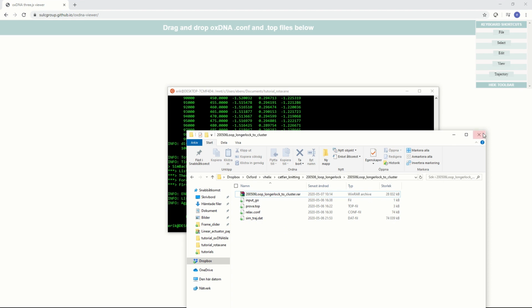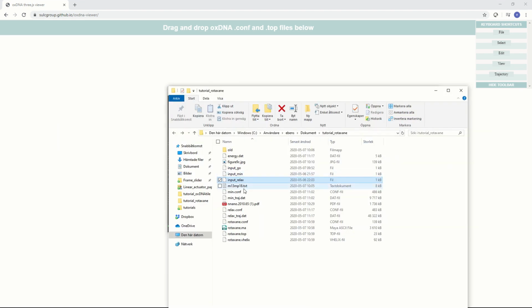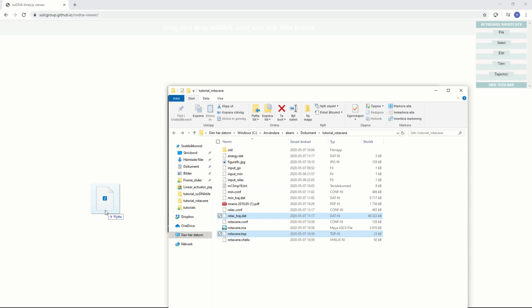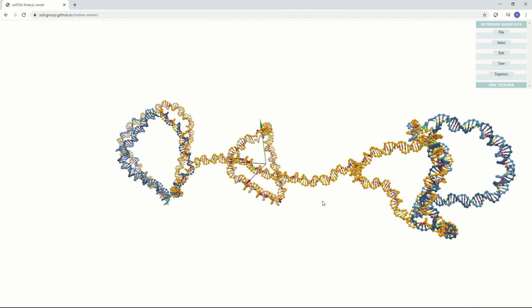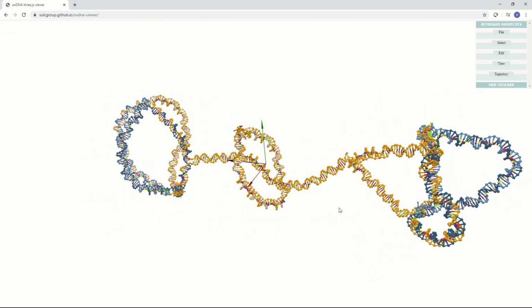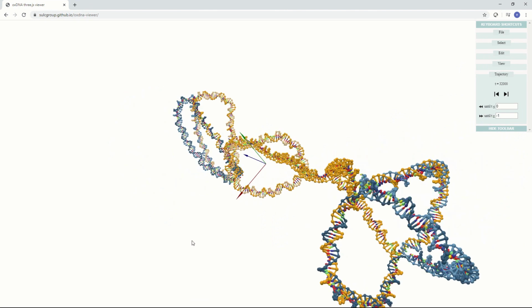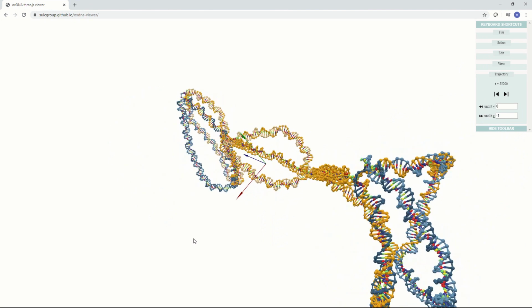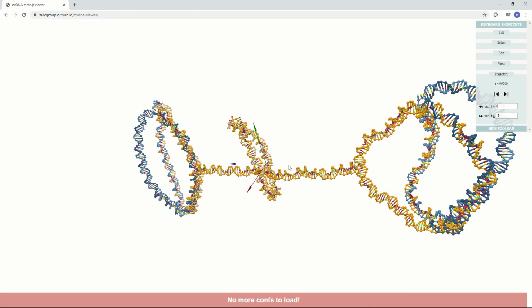We get this relax_try.dat, and we take it together with rotaxane.top and pull it into oxview. Now we can see what the relaxation simulation is doing. So it's actually quite quickly pulling together these overstretched bonds. And if we look into trajectory, already after 24,000 steps, it seems like these long bonds have been pulled together. And the simulation is going.